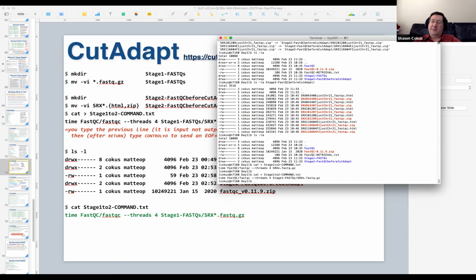And the way I usually let it happen is as you reach each stage, in stage n, you have the files that were produced as a result of stage n minus 1 at the beginning of the next step of the analysis. I let stage n plus 1 produce its outputs in the stage n directory. And then once everything's hunky-dory and there's no errors and you think it's roughly stable, I create the stage n plus 1 directory and then move the things for n plus 1 from n into n plus 1. That's how you inchworm your way along the pipeline.